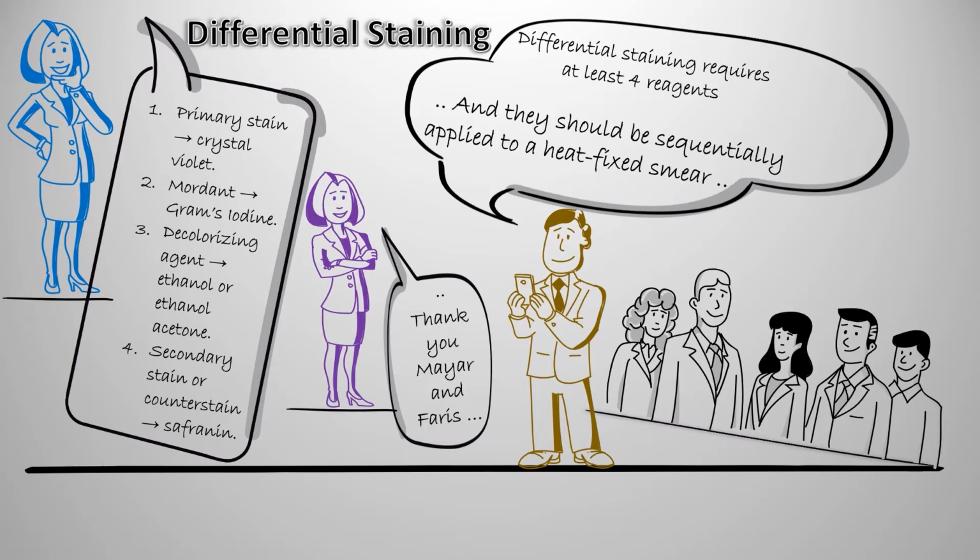And vice versa in case of the gram-positive bacteria, where it has a very little amount of lipids compared to the gram-negative, and a very thick layer of peptidoglycan.